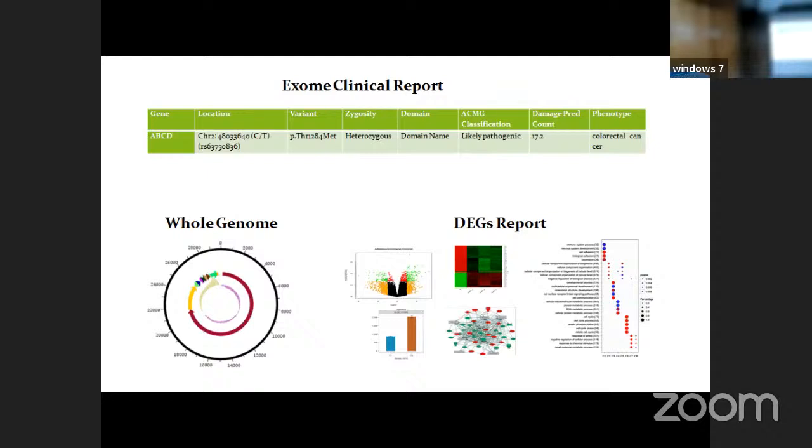But the next thing is that you can go for pathway enrichment, gene ontology enrichment and pathway enrichment, such that you can identify which pathways are getting enriched by these dysregulated genes. Now, when you are going for pathway analysis, you know which pathways are likely to cause cancer, right? And which pathways may not have even a minute role in cancer. There is enough literature in the public domain, right? And also you can make your own interpretation. Here, the interpretation of a biologist comes. Here, there is no role for bioinformatics, please remember. A bioinformatician can give you the likely pathways.